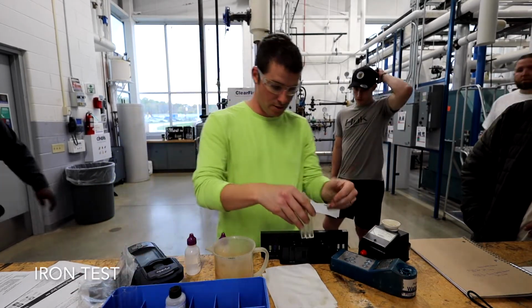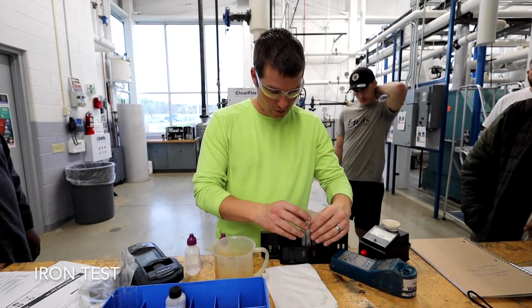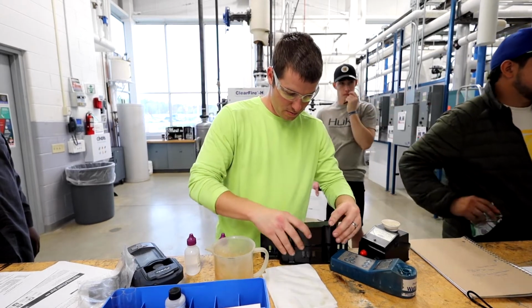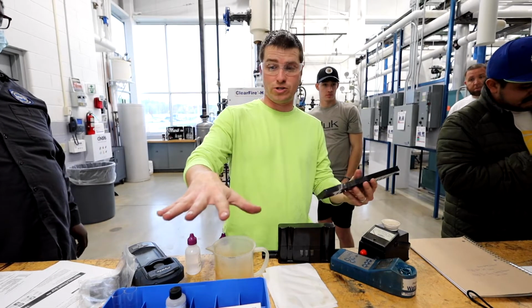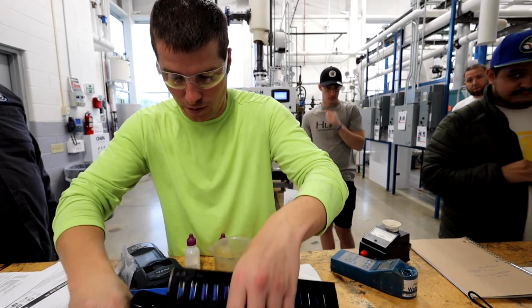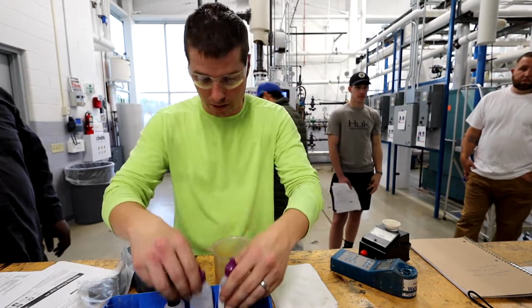Any questions on how to run this test for you guys? Otherwise, all you'll do is you'll return these. You'll cap this. So when we're practicing doing all this stuff, we're going to have all these types of materials and stuff. This is all your stuff. So this is what you're going to be doing. This is how you learn how to actually do it, is actually running the test, right? So we'll put these all back.